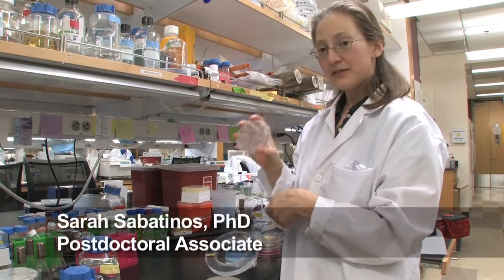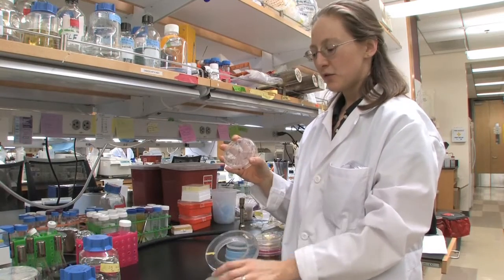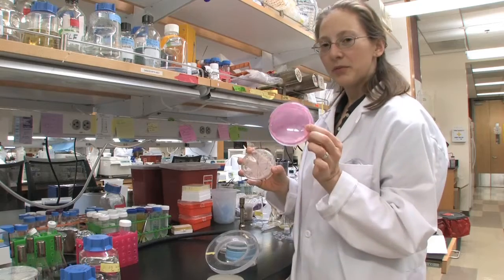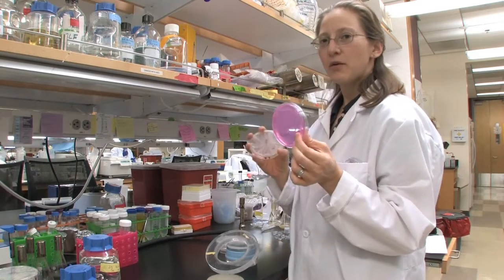So I'm going to take this plate of yeast and I'm going to make a copy onto different kinds of plates. So one is a drug plate and another one is a plate that has a chemical that helps us look for fitness. So if the cells are sick or if they're healthy.